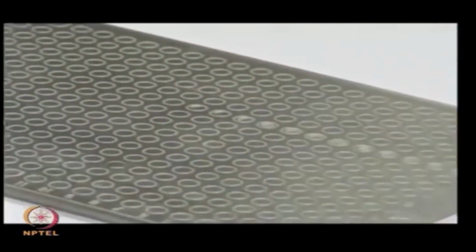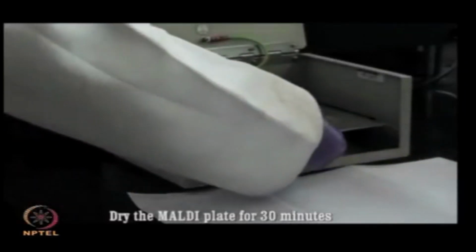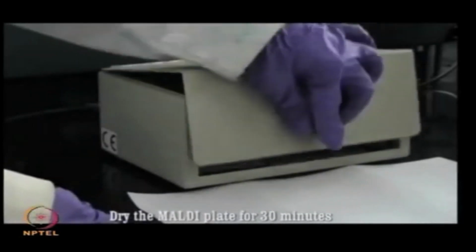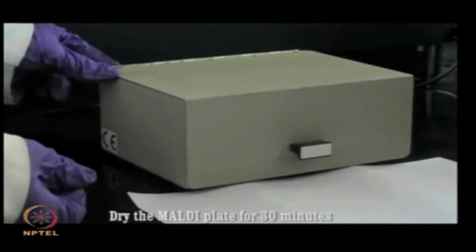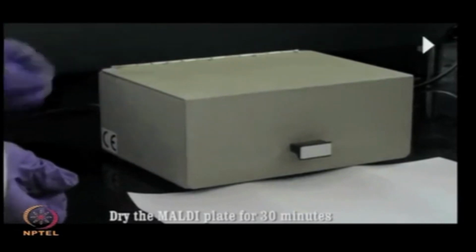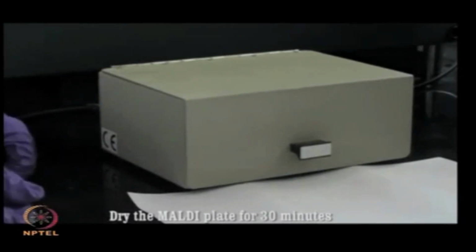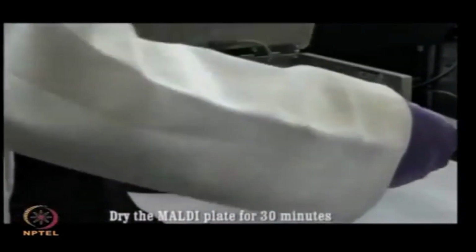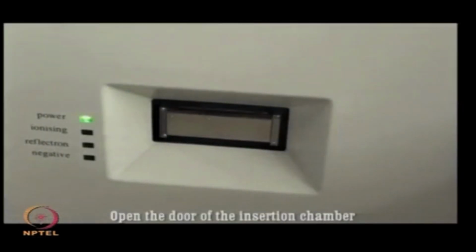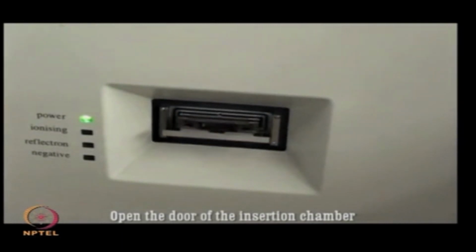Once completed on the MALDI plates, the samples are allowed to dry for 30 minutes, after which the instrument is switched on and MS analysis can be performed. While these steps are happening, you need to ensure that the instrument is on. So, click on the software, open the acquisition window and then click on open door.